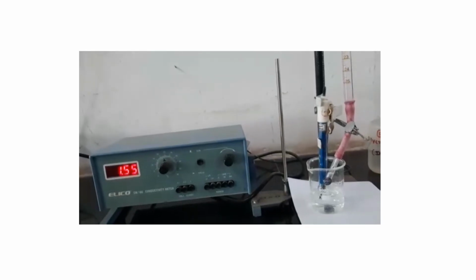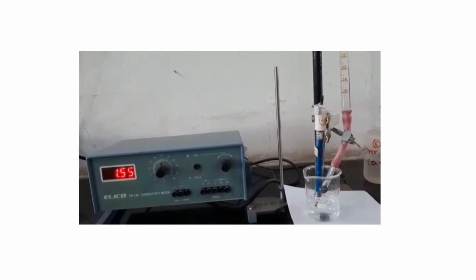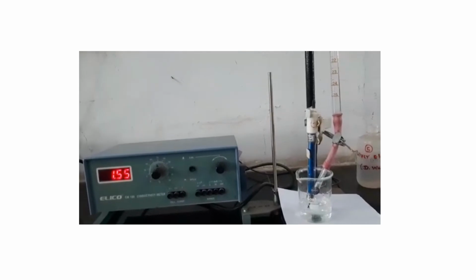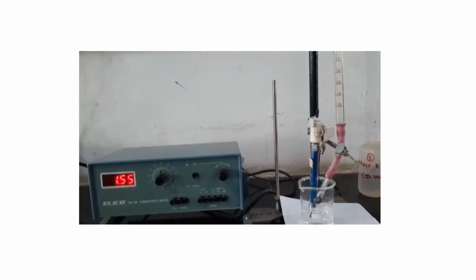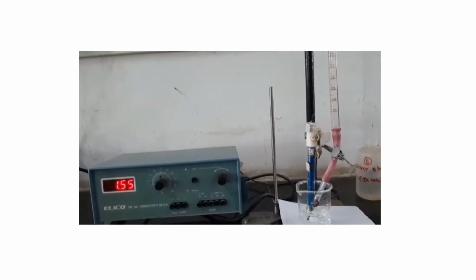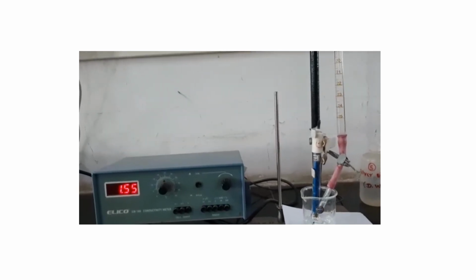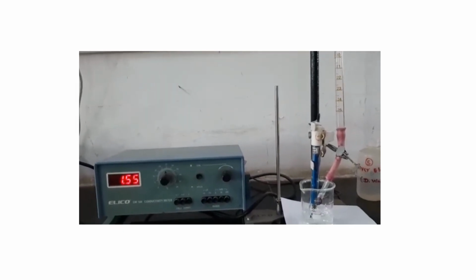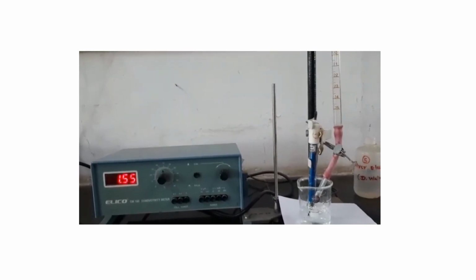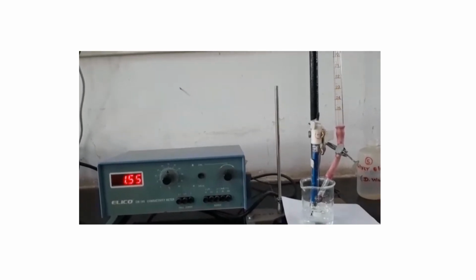This is the conductance value. Now we observe here the conductance value changes by addition of NaOH solution. Thus we have to add 0.5 ml NaOH, and after every addition of NaOH we have to note down the conductance value. Thus we have to perform the practical up to the completion of 10 ml NaOH solution.